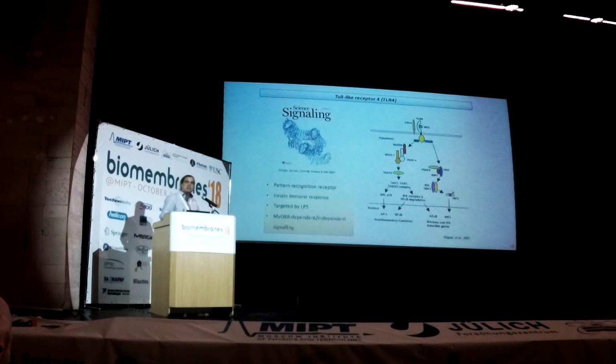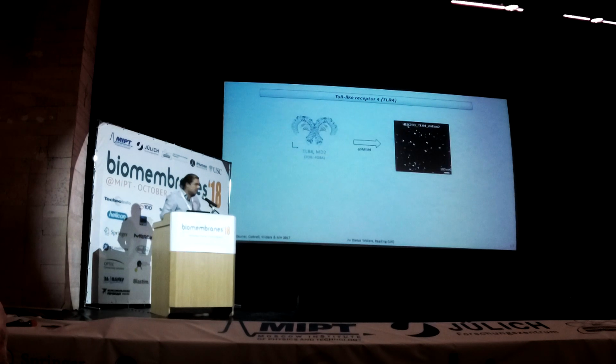And there is some history behind that, some publications suggesting that this receptor organizes into large clusters, whereas other, mostly biochemical methods, suggested that there would be monomers and the activated receptor would be a dimer. So a perfect target for us. So we studied that using the very same method. We began with a suitable cell model again, very important. No random cell or random overexpression. That's really not good with these receptors.